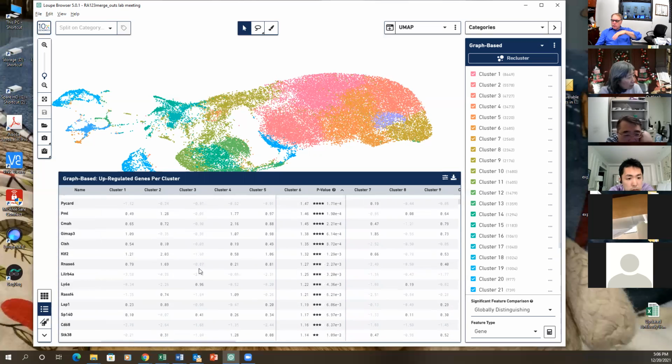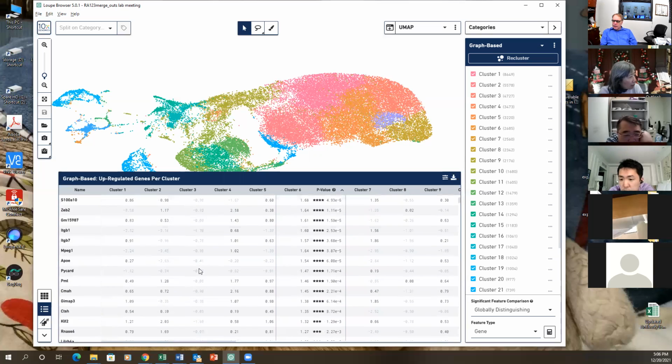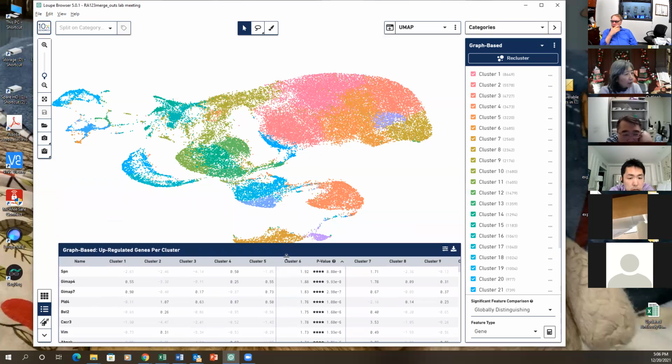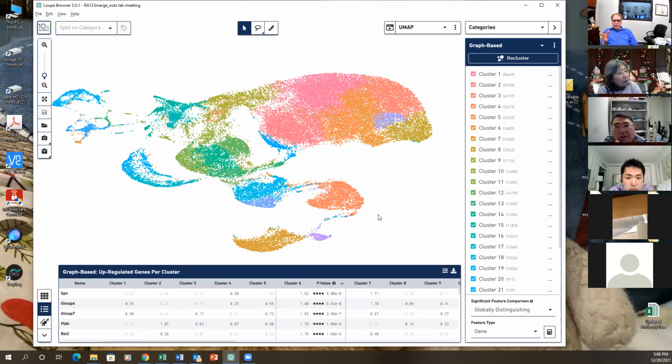Shimon, are these 3 mice together? This is 6 mice together. 6 mice. So there's IL-17. So let's see which one has more.